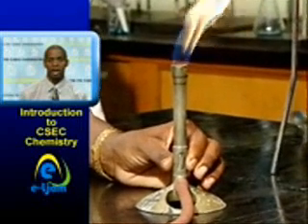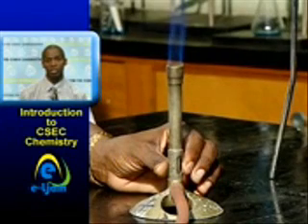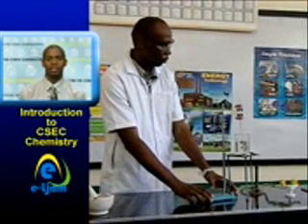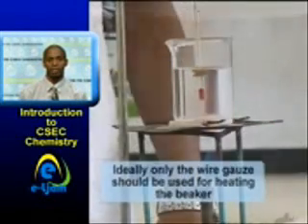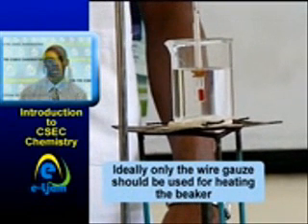Adjust the flame by turning the collar so that you have the appropriate flame for the experiment, usually the medium blue flame. During the experiment, stay vigilant so that if a problem occurs, you're ready to turn off the flame quickly. This means that you should not leave your table unattended.